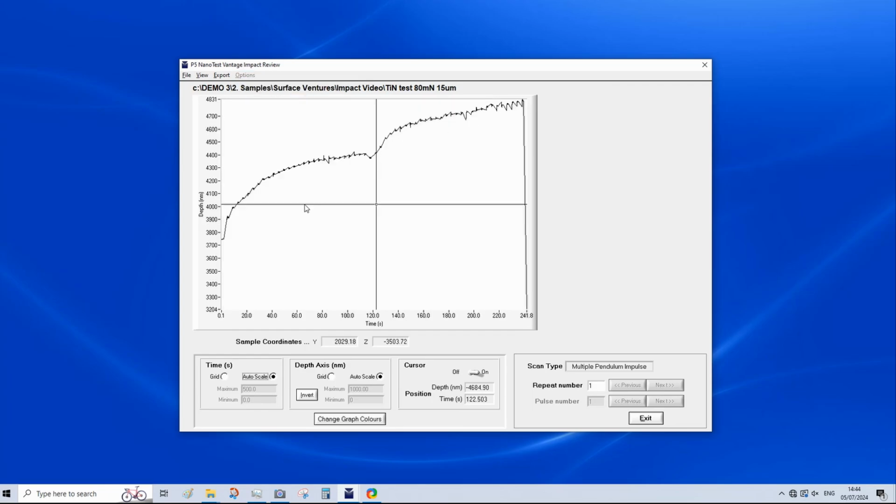As you can see, that's changed quite dramatically. When the indenter impacts a sample, there's the primary impact, but also the successive smaller impacts as energy is lost from the system. Removing spikes will smooth these smaller impacts out of the data.